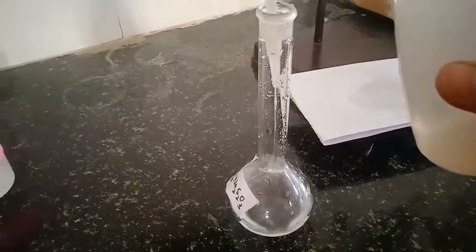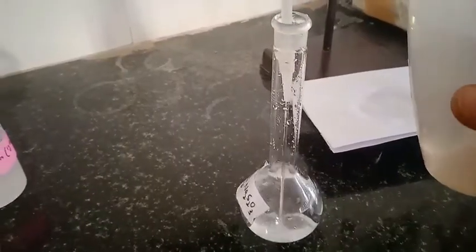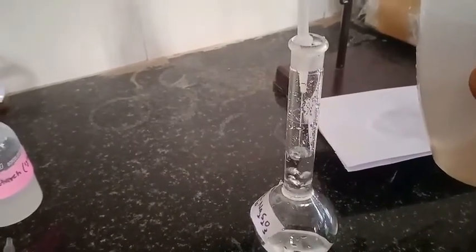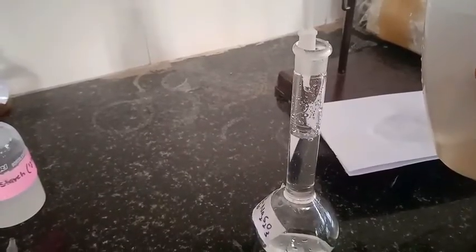Now make up the solution up to the mark with distilled water. This measuring flask is of 100 mL — this is how we prepare N/80 sodium thiosulphate solution by dilution method from the standardized N/10 sodium thiosulphate solution.